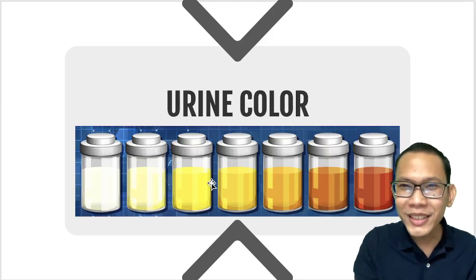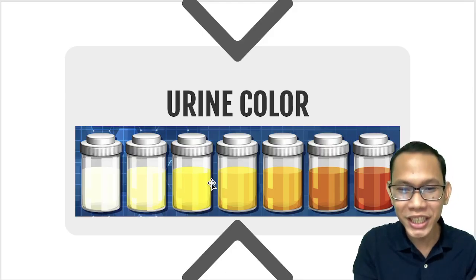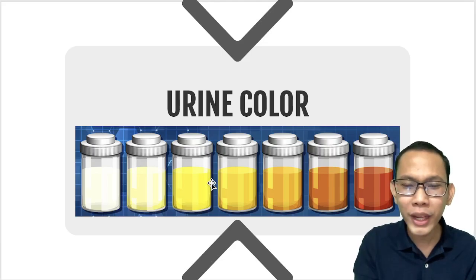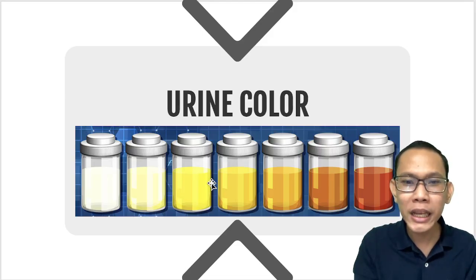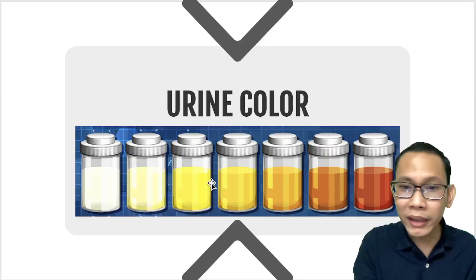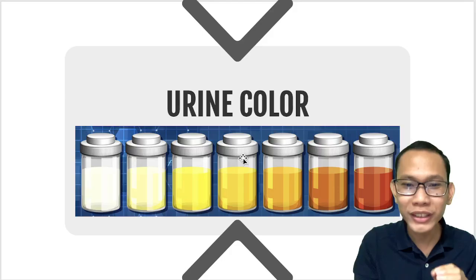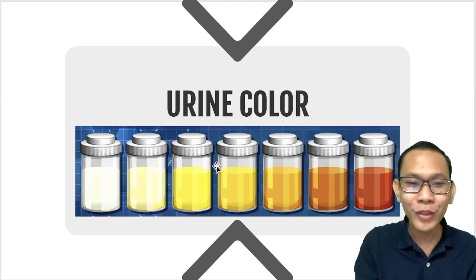Yellowish na lang, parang something-ish. So, do not put ISH, yellowish, greenish, reddish as your urine color. Identify it correctly. Yellow, dark yellow, light yellow, pale yellow, red, pale red, light red, dark red, but do not put ish on the end of the color. Yellowish, reddish. Hindi yan. Mali talaga yan. Okay? Don't have to identify that.